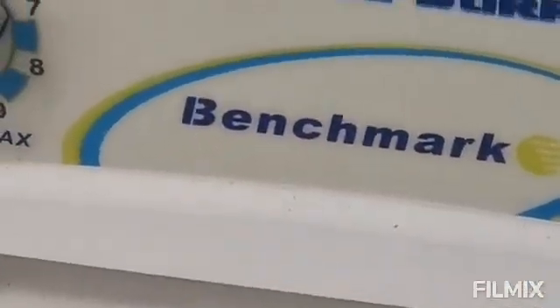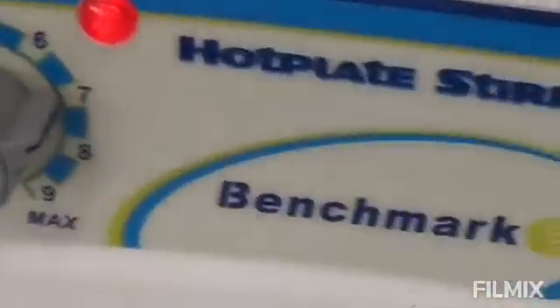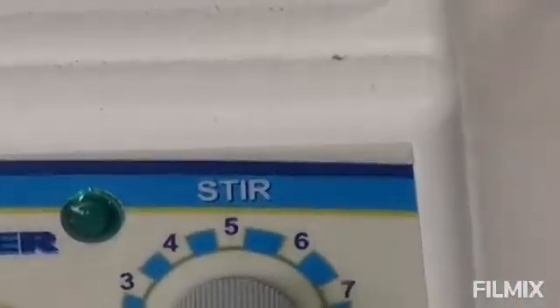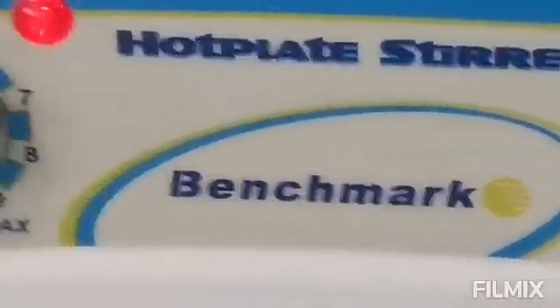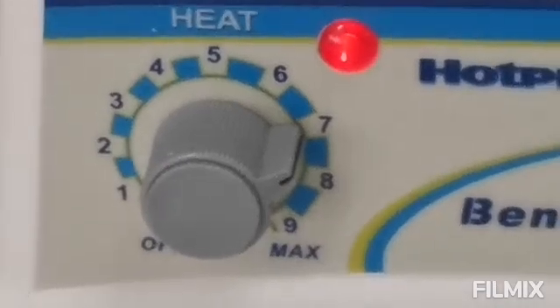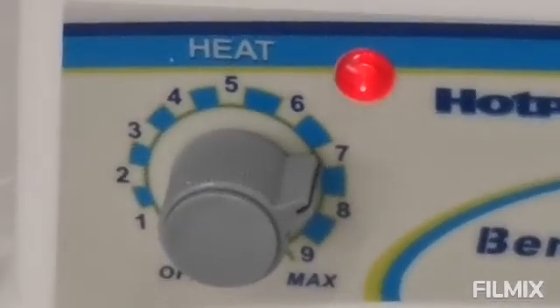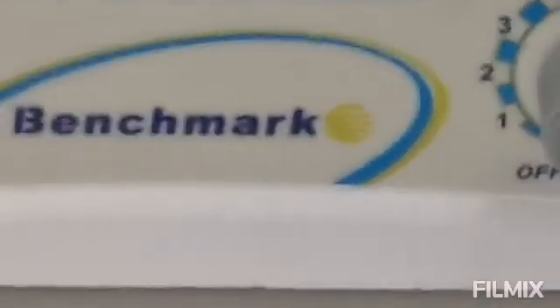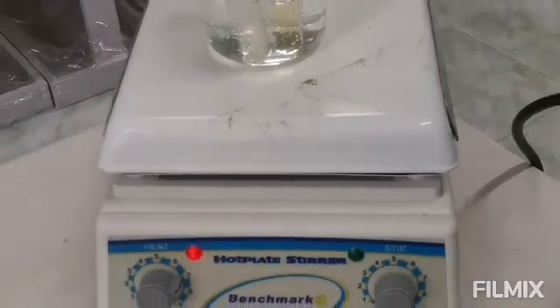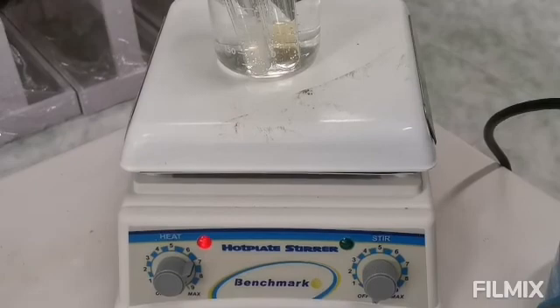You are using a very expensive hot plate. This has its own built-in stirrer with a certain speed, aside from the regulated temperature or heat. You will meet again this kind of hot plate when you will have your analytical chem, hopefully next semester.